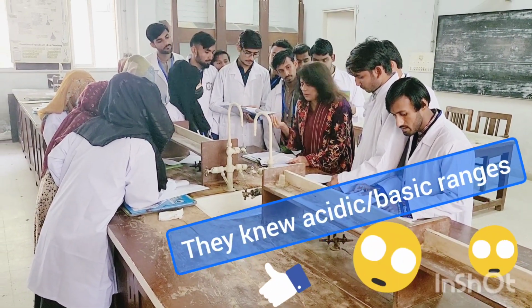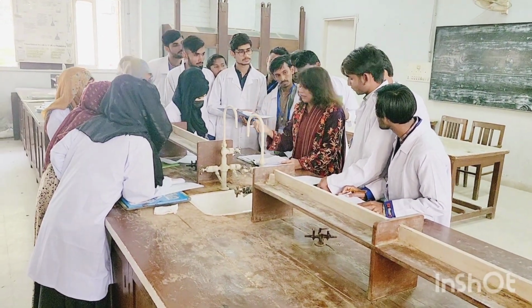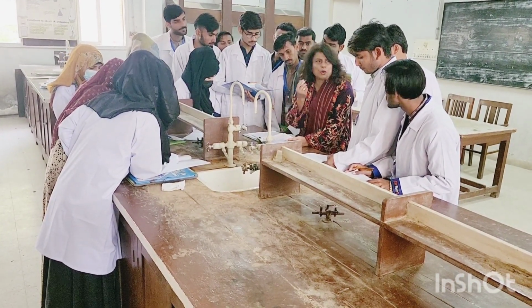You will take a test tube, wash the test tube with tap water, then rinse it, and then you are going to take a small amount of the given compound. Here they have written what you are going to do: take a small amount of the given compound in 2 ml of water or ethyl alcohol.